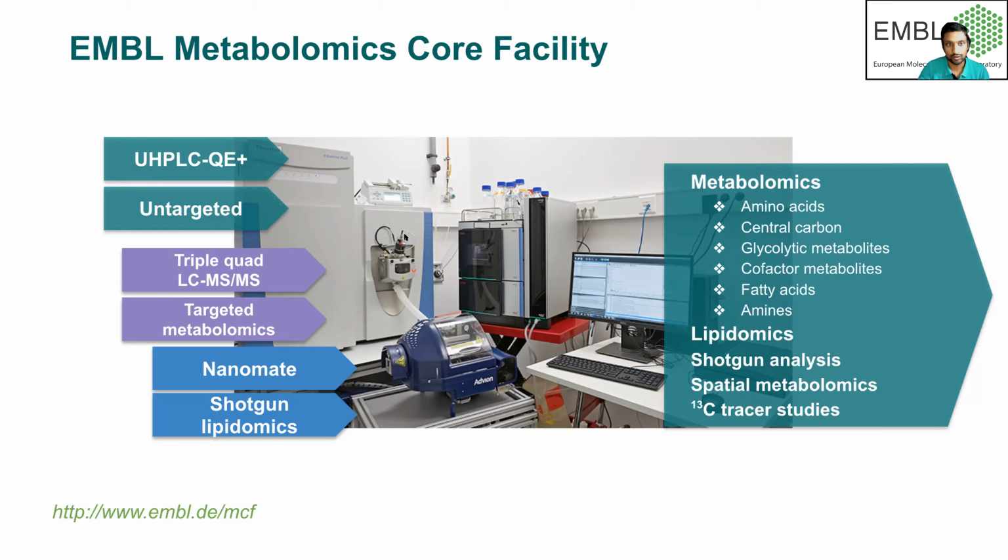And with this particular Orbitrap, you can detect the exact mass of a metabolite up to 2 ppm accuracy. Not only that, it can fragment the metabolite. You can generate MS/MS data, and that way you can identify the metabolite. Hundreds or even thousands of metabolites can be analyzed in one single analysis. So this is like an untargeted approach, where you extract metabolites and run them through.